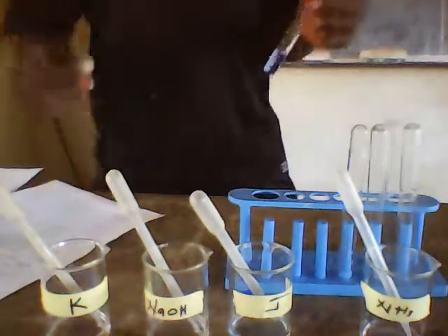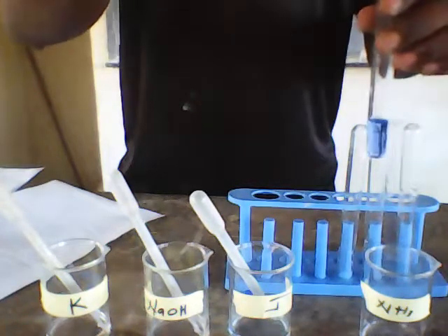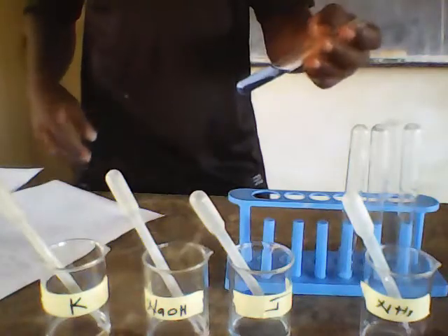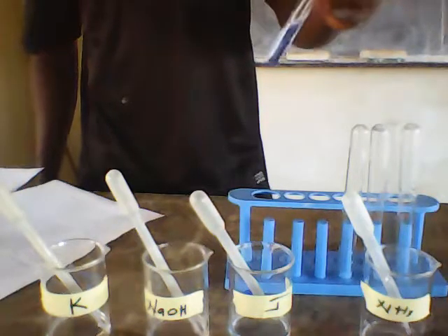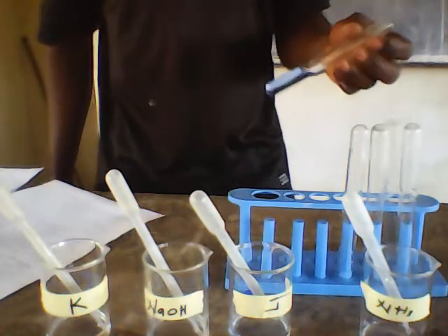Then I'm supposed to add excess ammonia. So here, when I add excess, I discover that the blue precipitate has turned to a dark blue solution. So I'll write: the blue precipitate has turned to a dark blue solution.